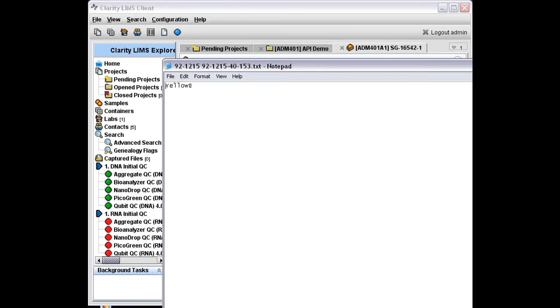So we've gone end to end there in creating a process, to connecting it to an EPP node, to creating command lines, to show parameters being used, as well as illustrating the capture, which happens automatically, of files. So hopefully that was a useful exercise and that you've completed this yourself and you've got this to work. Thank you.